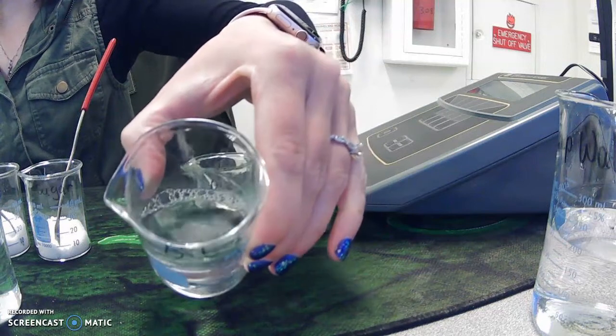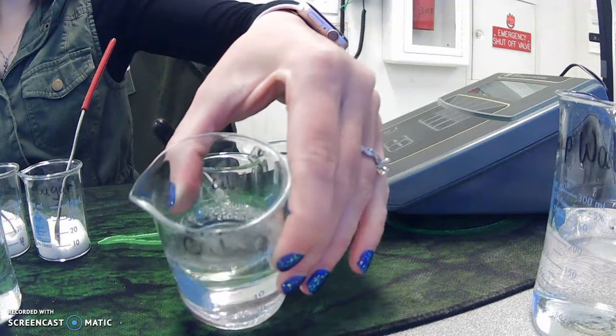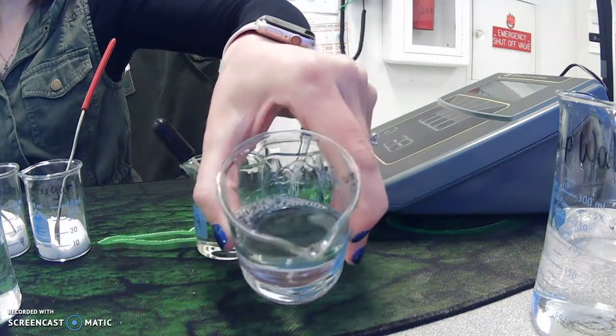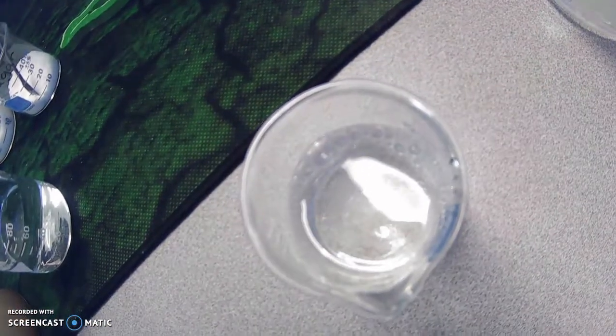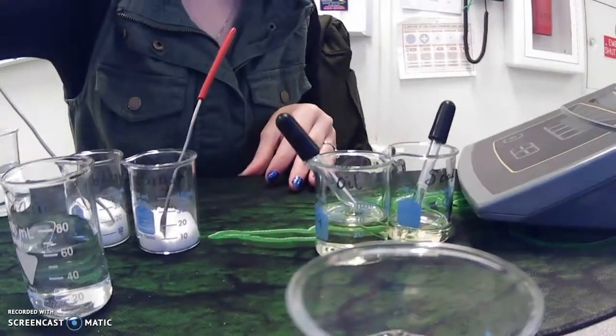Like we see some bubbles now, but not really oil, that's just from the soap. There's teeny tiny little oil dots on the surface. There's not the same large oil droplets that there were.